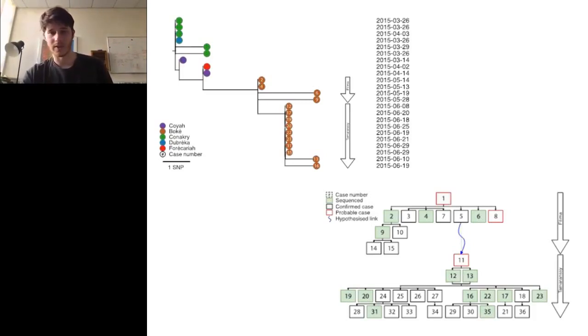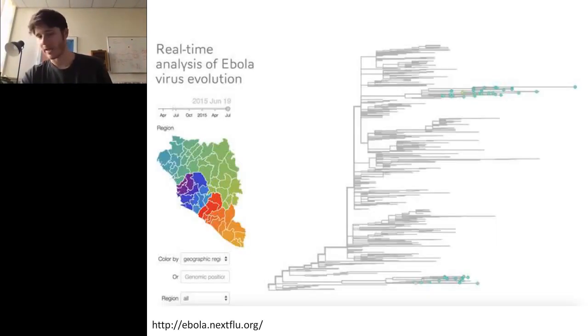And in this case, the genome data exactly recapitulated the story which was developed by epidemiologists. So this is to illustrate that this type of thing could become an asset, or maybe even a replacement for epidemiologists working on the ground, doing a lot of laborious manual work.